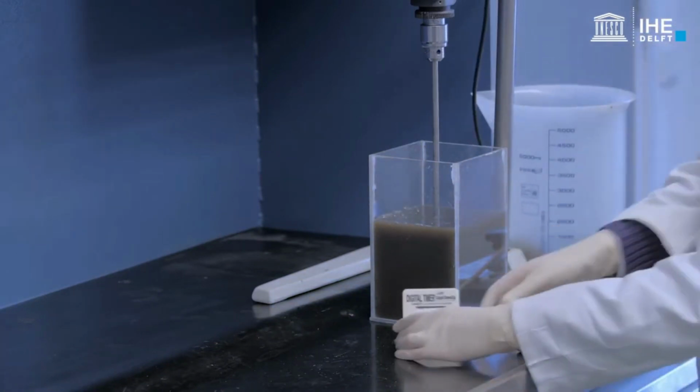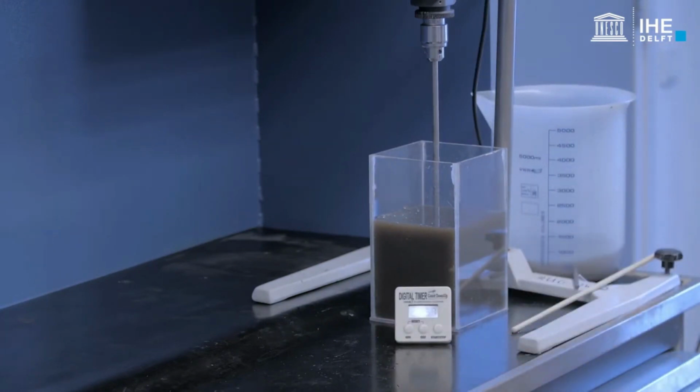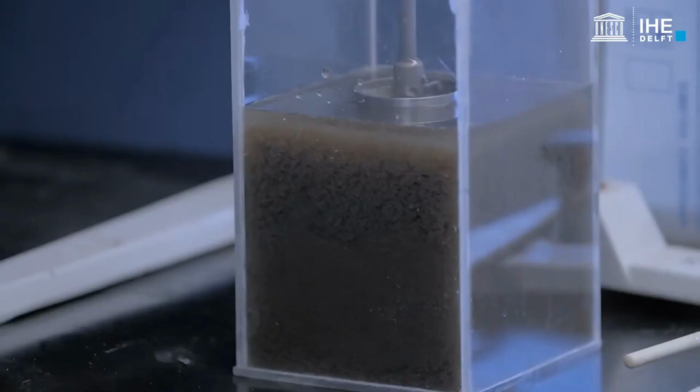Start the timer. Check visually that the entire sample is well mixed.